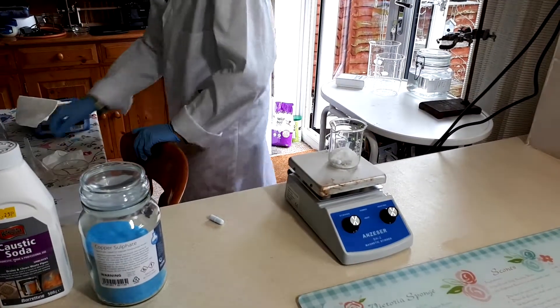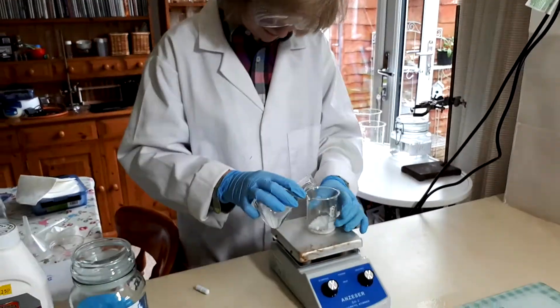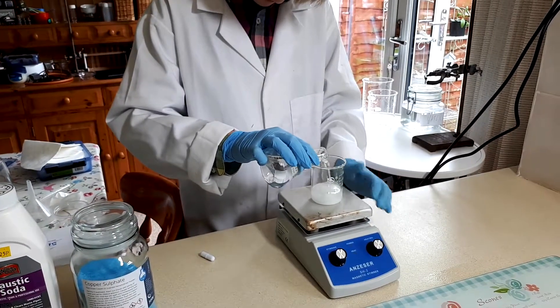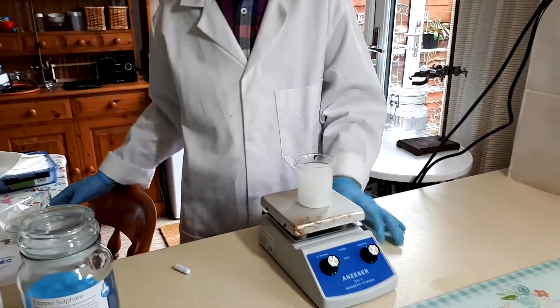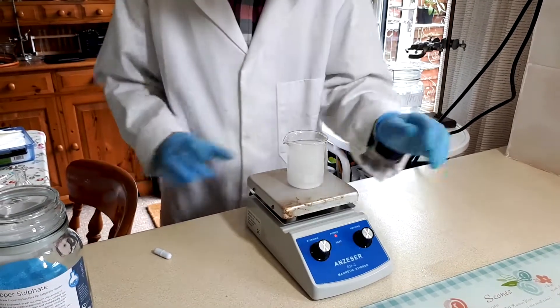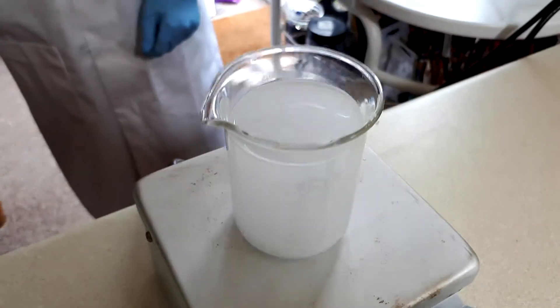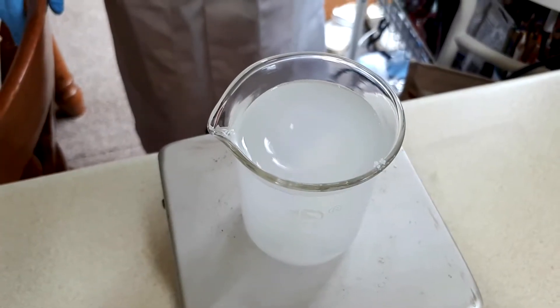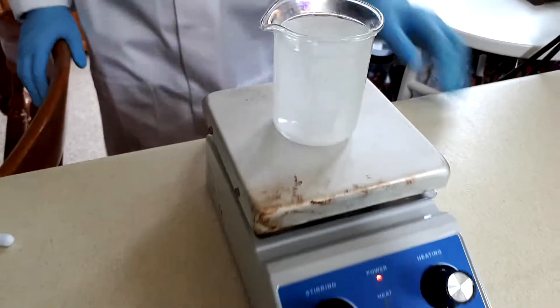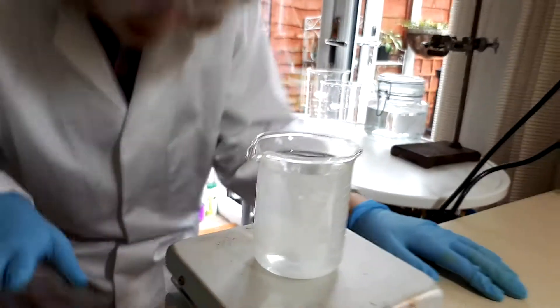And let's add 100 millilitres of water. As I've said in quite a few of my videos, it's extremely exothermic. So don't touch the liquid inside until it's fully dissolved and cooled down.